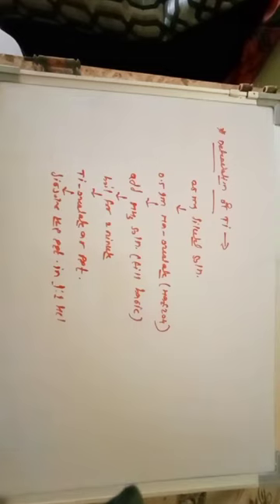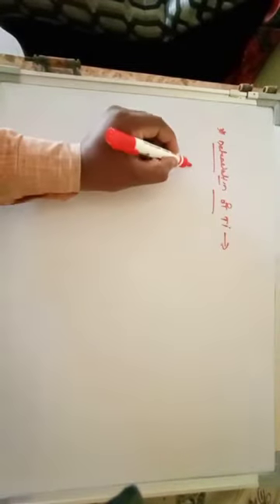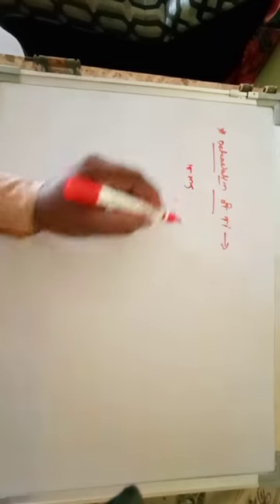Let us discuss the next procedure. You take the diluted solution, add sodium oxalate, and then add ammonia till the solution is basic. Boil it, and titanium oxalate forms as a precipitate. Dissolve the precipitate in 1:1 HCl. The procedure continues.